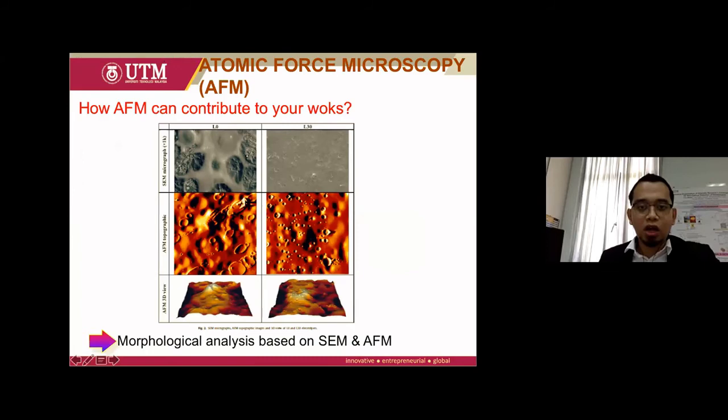When you have an AFM image, you can optimize it based on the AFM 3D view. This usually comes together with the sample analysis. You can play around with the software there, and you can generate the image based on the morphology, the micrograph image that was obtained. So you can further analyze it to see the depth, the z-axis that I mentioned, the depth of the sample and the contour of how it looks like.